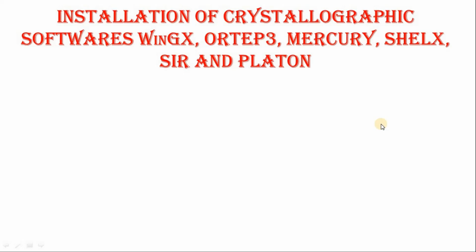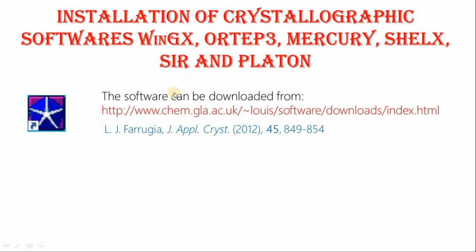Hello everyone, welcome to this video tutorial on installation of crystallographic software like WinGX, ORTEP3, Mercury, SHELX programs and Platon. First of all, let's come to the WinGX software. This software can be downloaded from the following link, and this is the reference for this crystallographic software.